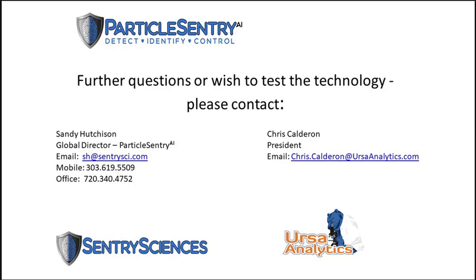Thank you. Our next question is from DP. What kind of output does your software provide in addition to the fingerprint? Yeah, so in addition to the fingerprint, the current version of the software outputs test statistic values and corresponding p-values for those test statistic values that are a little more intuitive.